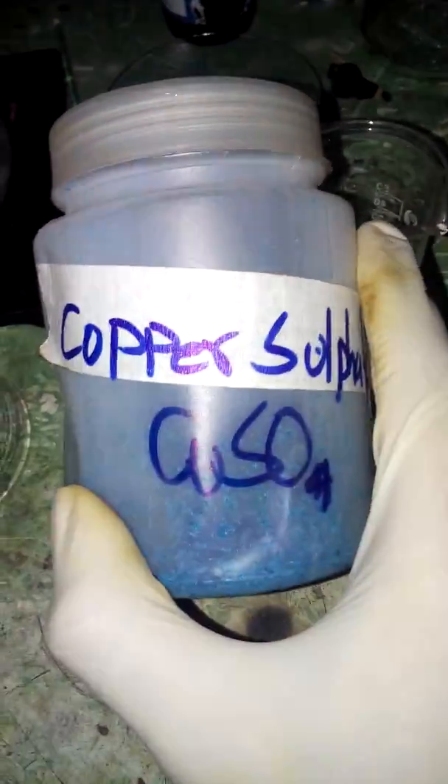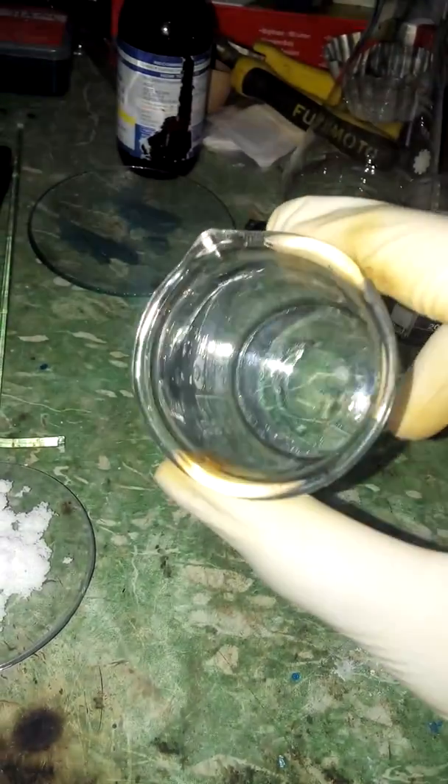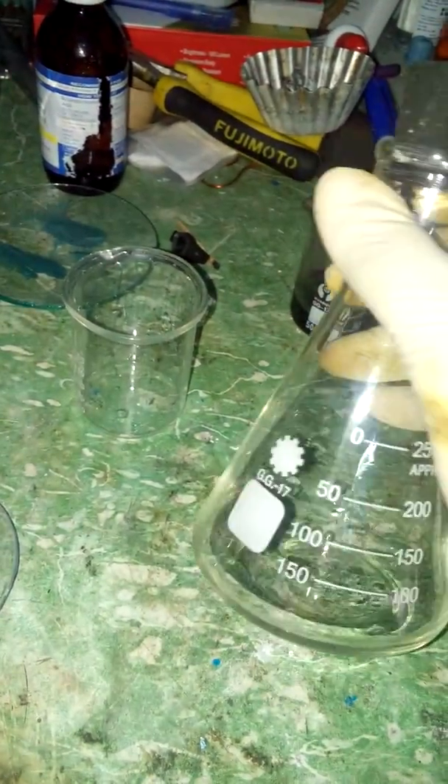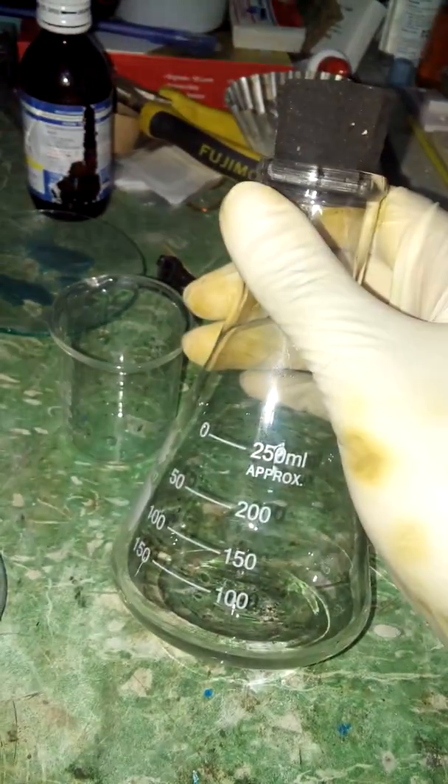Hi guys, today I'm gonna show you how to make copper chloride using copper sulfate and table salt. For this you'll need a beaker — I've got a 50 ml beaker, make sure it's clean. Optional is if you want to transfer it to something bigger, you're gonna need a container.